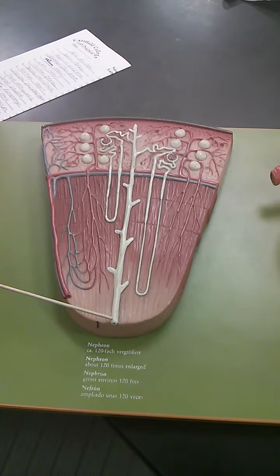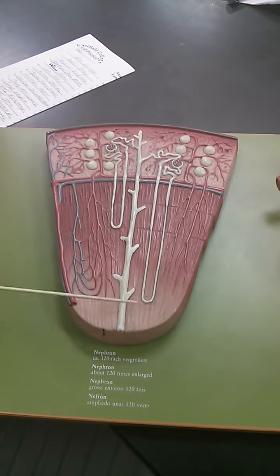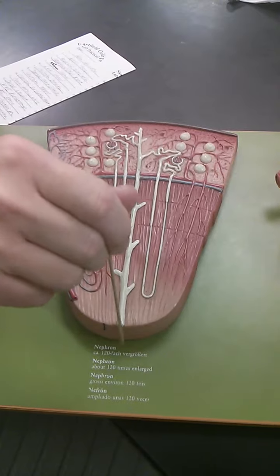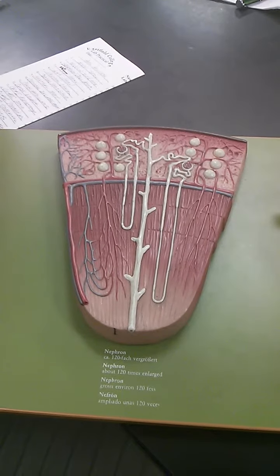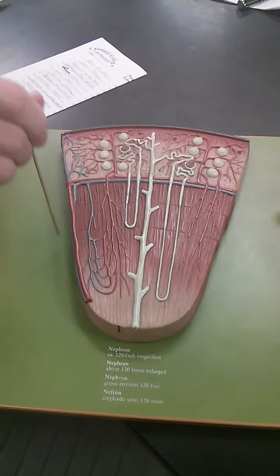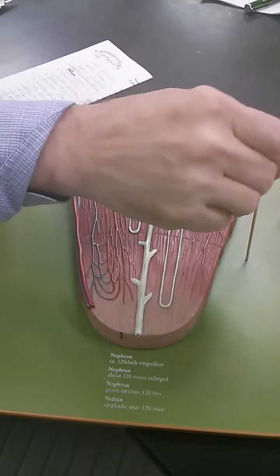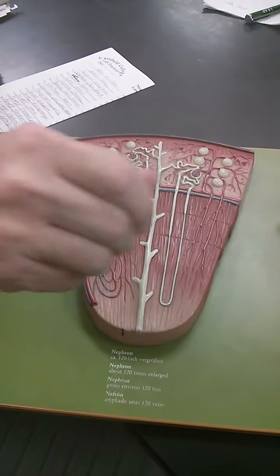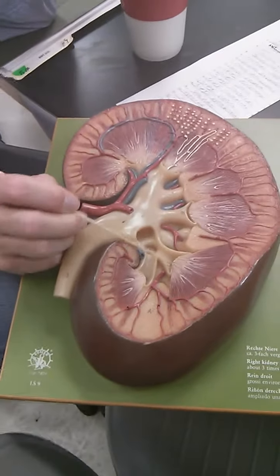When you come down here to the collecting duct, it is minor calyx? No, the point, the apex. The papilla? Papillae, thank you. The renal papillae is this point. Okay. You have space between these medullary pyramids, okay, and those are called the renal columns, is that space between the pyramids. Right here at this side and right here at this side would be the beginning of the minor calyx. Now if you look at this model, here are the minor calyx, right up here to the side of the pyramid.